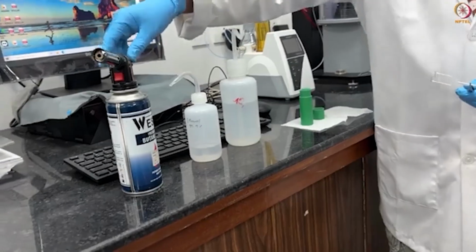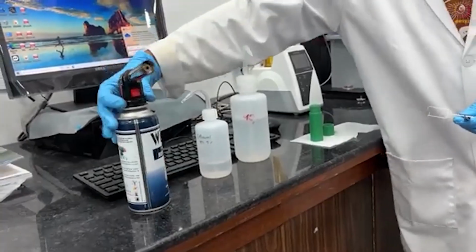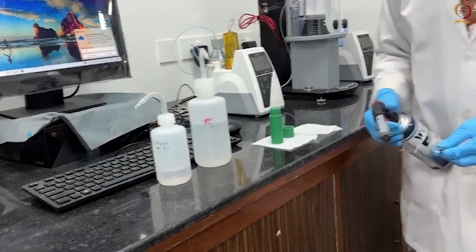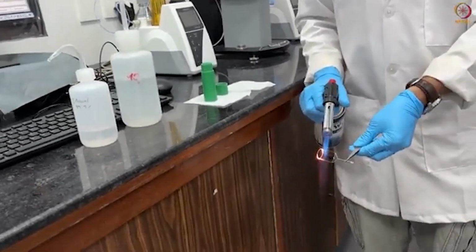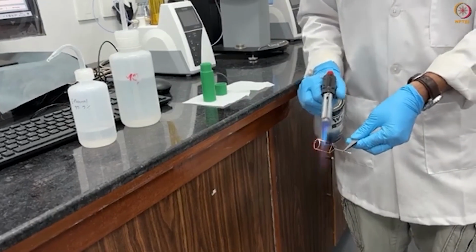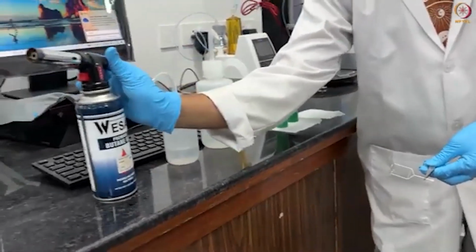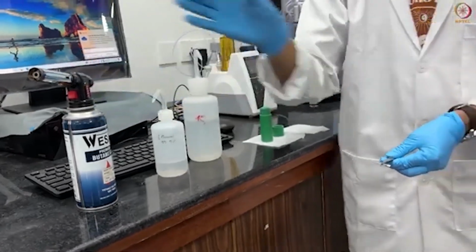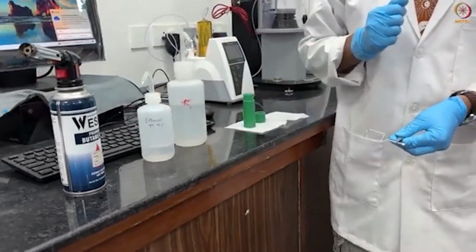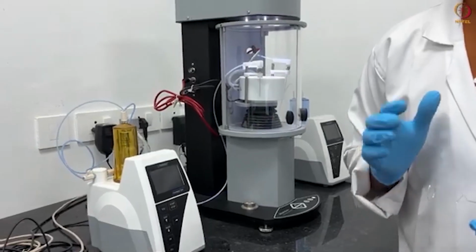After this, you will use butane gas or apply a flame to remove any biological contaminants. Continue cleaning until it looks clear. Now our system is cleaned properly and the ring is ready for the measurement. As of now, we have completed the cleaning process.